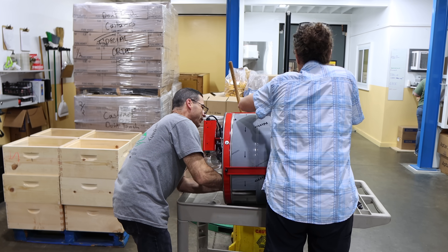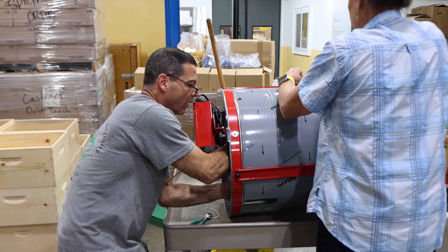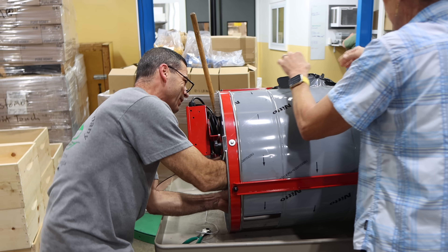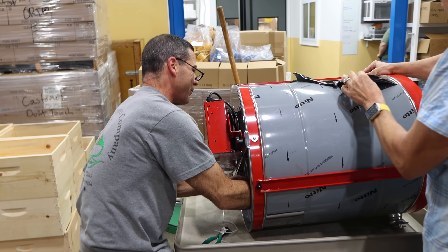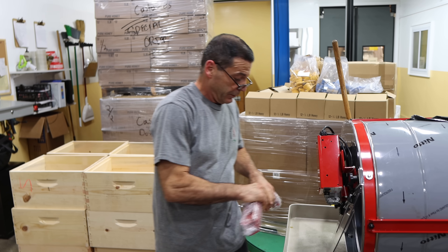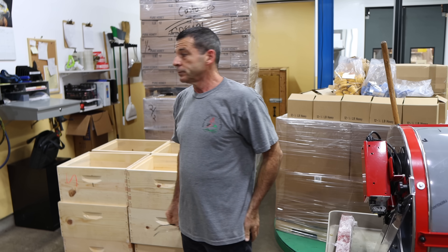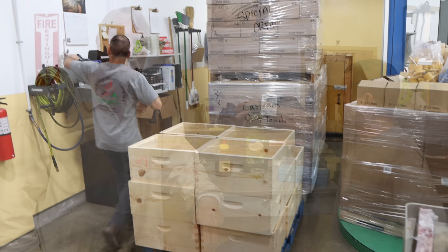Louie and Katie are busy assembling extractors because it's honey extracting season. But the real reason I'm here — Louie, can we talk about refractometers? Yeah, I think now's the time. We're going to try to put up a little video on it, so get out your refractometer and we'll talk about it.